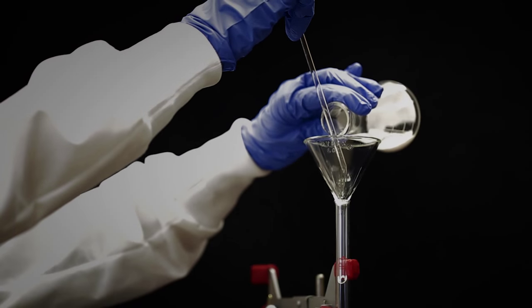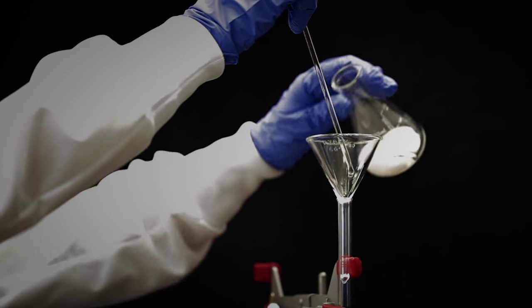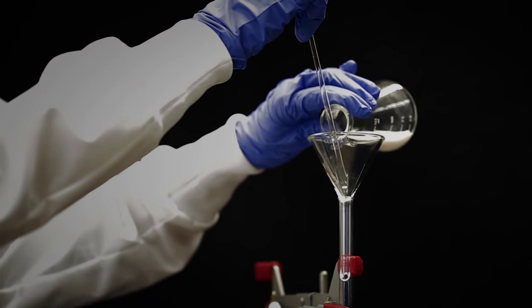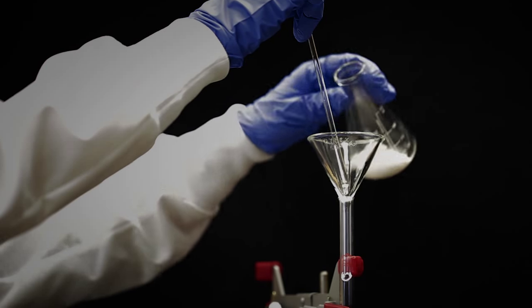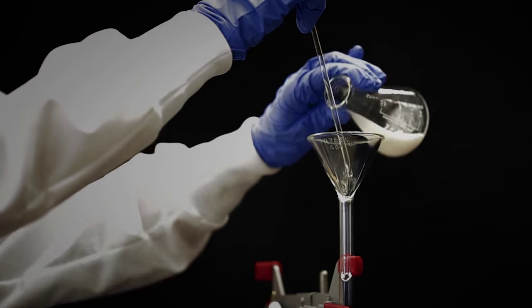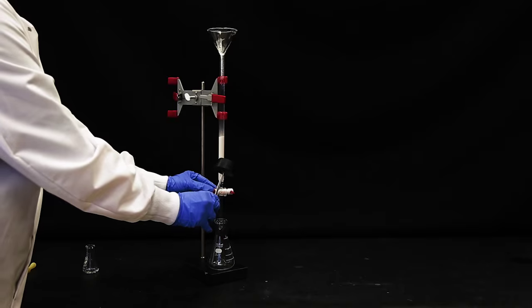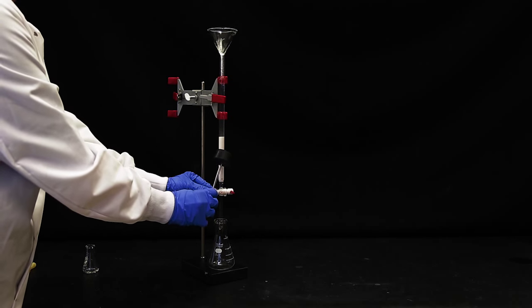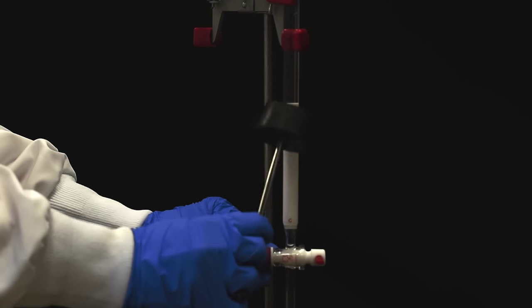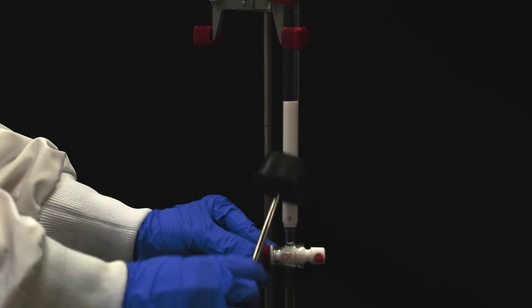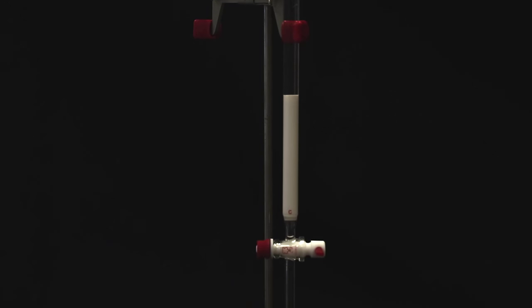Pour the slurry into the funnel at the top of the column. Continue swirling and pouring the slurry. Use a rubber stopper to tap the column to release air bubbles as the slurry is added. More hexane can be used to add the remaining alumina to the column.